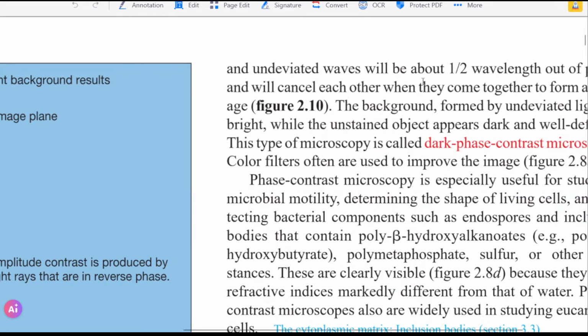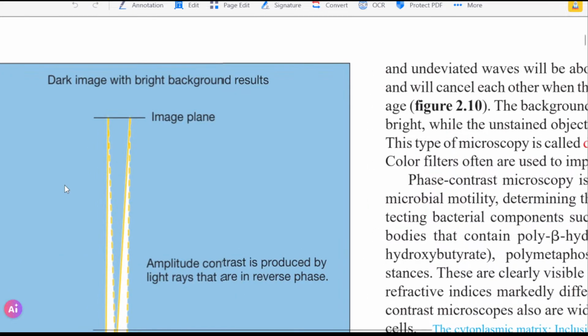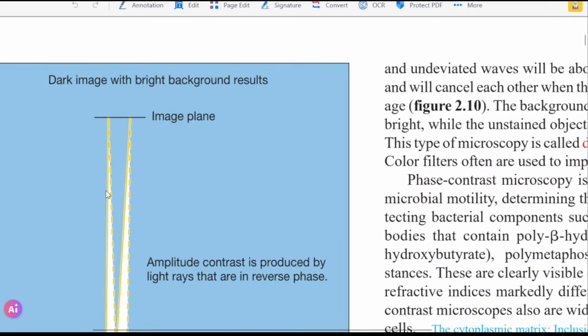After that, of course, they are going to combine with one another, because in the starting the wavelength wasn't a different wavelength, right? So when they combine, they want to go to the original position, but in this case they can't, because the wavelength has been changed by about 1/4 up and down, and here this becomes 1/2.